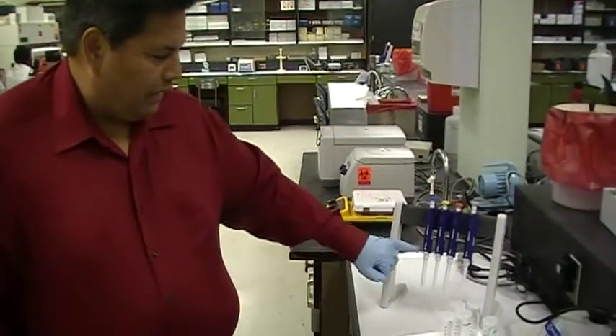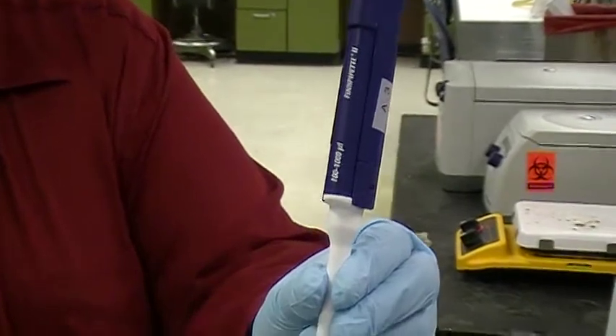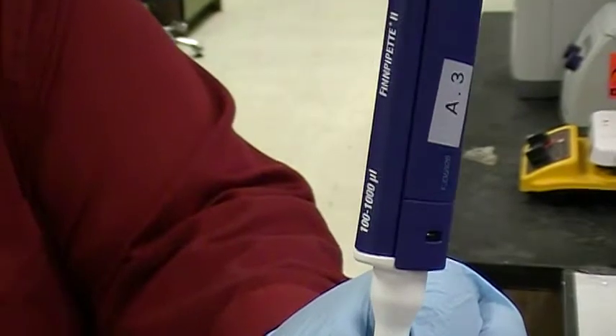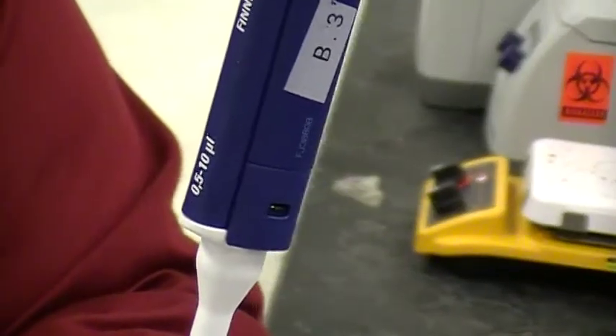The first thing I need to point out is that on the side of each one of these is the range within which you can pipette volumes. The blue one, the P1000, has a range of 100 microliters to 1,000. The yellow one has a range of 20 to 200 microliters. The orange one has a range of 5 to 50 microliters. And the gray one has a range of 0.5 up to 10 microliters.